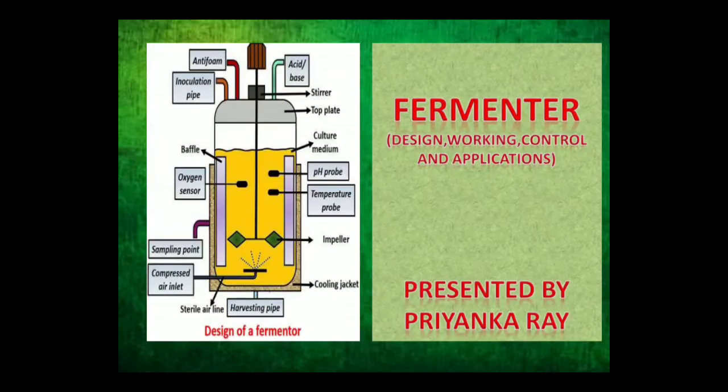Dear learners, my today's topic for the lecture video is fermenter. We are going to discuss in detail about the design of the fermenter, the working procedure, the different control parameters and the applications of the fermenter.